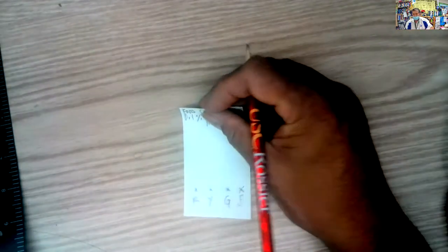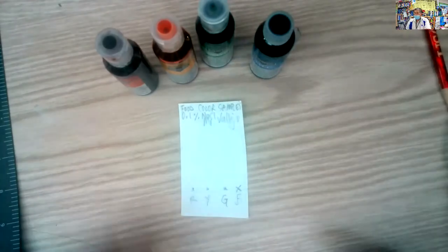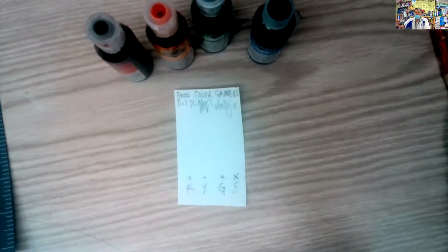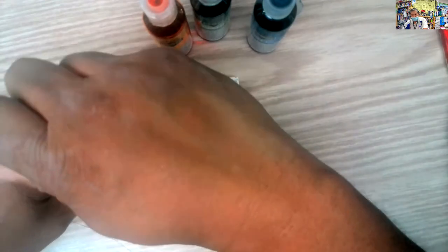All right, so now I'm going to go over here, and I happen to have my food coloring right there. Let me adjust the light a little bit so you can see it better. I also have a bunch of toothpicks right here. I'm going to spot each of these X's with the different food coloring, and then let it dry for a few minutes.